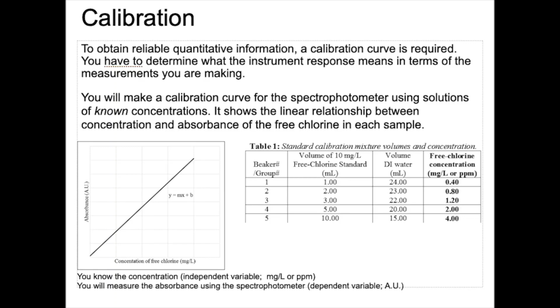And the best way you can remember that also, if you can't decide which one's independent, which one's dependent, is to think about how you got it. So the concentration is the concentration, and that is independent of anything, but the absorbance reading is dependent upon the concentration. And spoiler alert, we are going to see that with higher concentrations, there's a linear and direct relationship with the absorbance. So as concentration increases, absorbance will increase too.